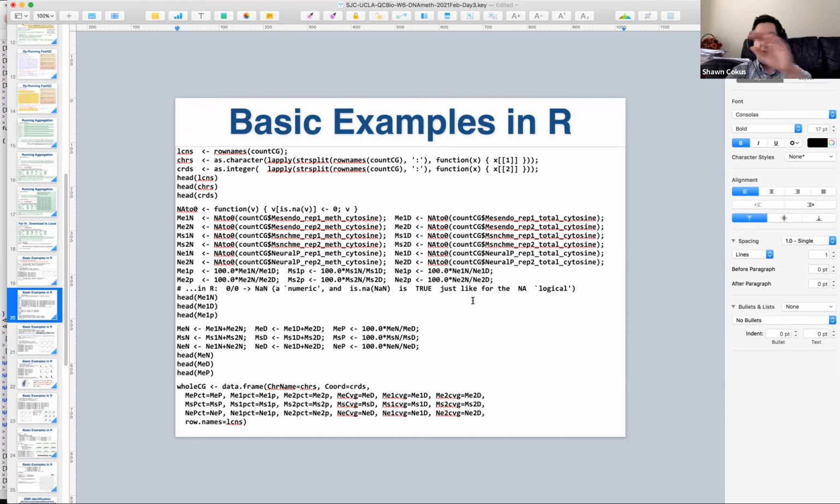Because if you do the add numerators divided by add denominators, then if everybody's got coverage 5 and somebody's got coverage 500, the guy with coverage 500 sort of takes over, right? Pulls that really hard in this direction. Whereas if you turn them into fractions and average those, then that guy that would otherwise pull very hard is only one nth of the sample, just the same as everybody else next to him. So anyway, that's why I recommend at the site level, maybe pool numerator and denominator, then divide, but when cross site, then divide, then average. That's my recommendation.